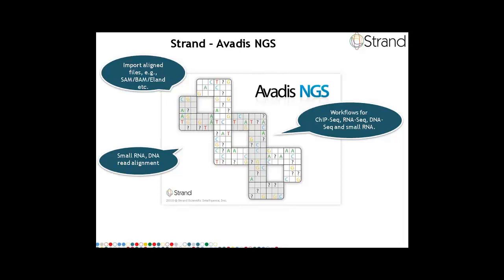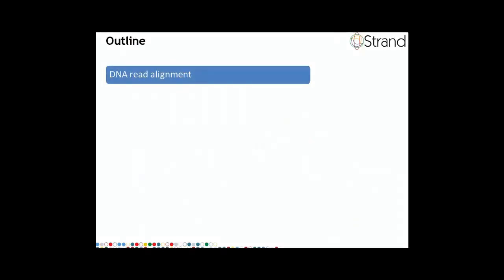The upcoming version of Avadis NGS will feature RNA read alignment also. In this webinar, we'll go through the details of the RNA read alignment workflow. The outline of today's webinar is as follows.